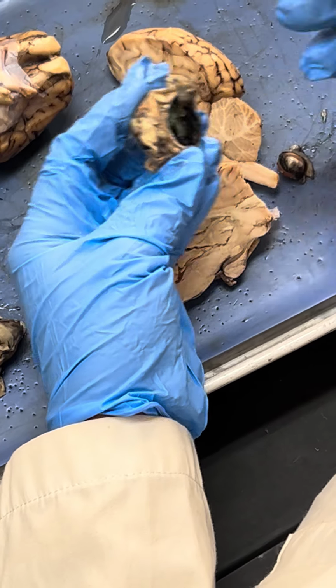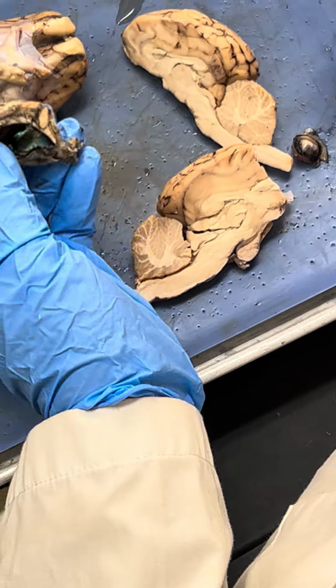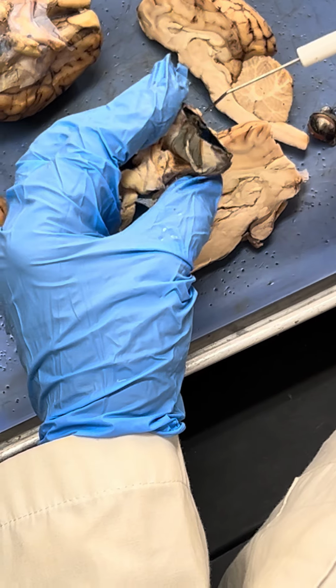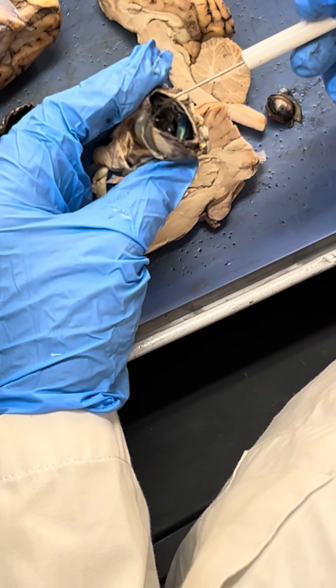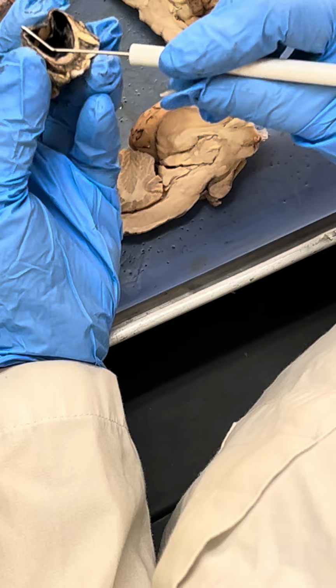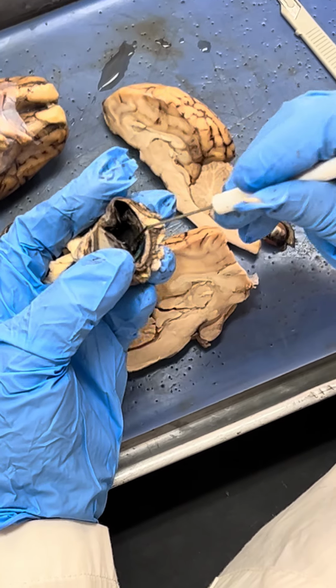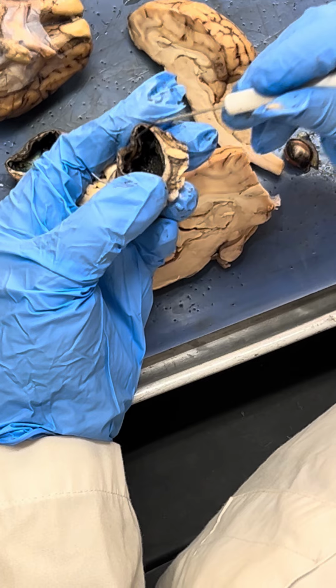This black area. Now here there are two chambers. One is anterior, another is vitreous. So if you see in the front a very little space, I can put my pointer here.